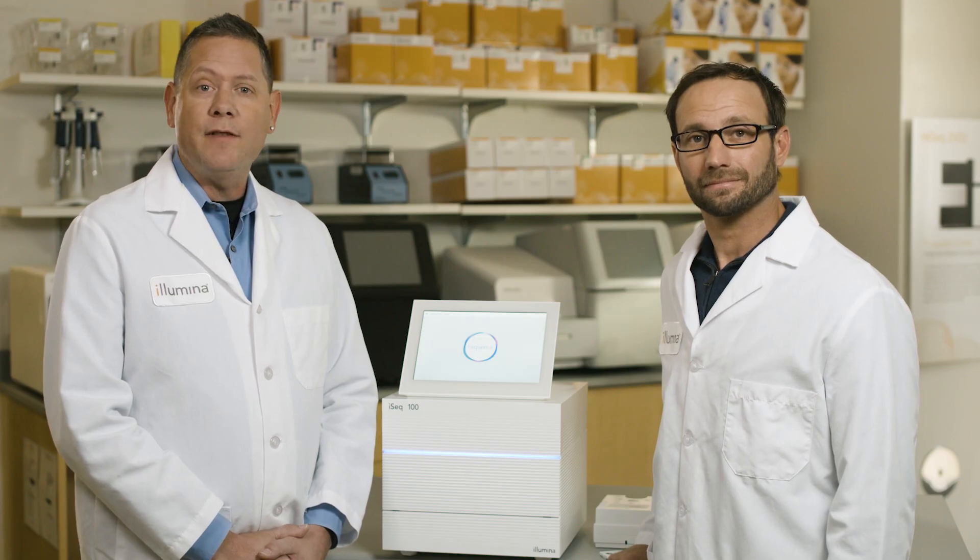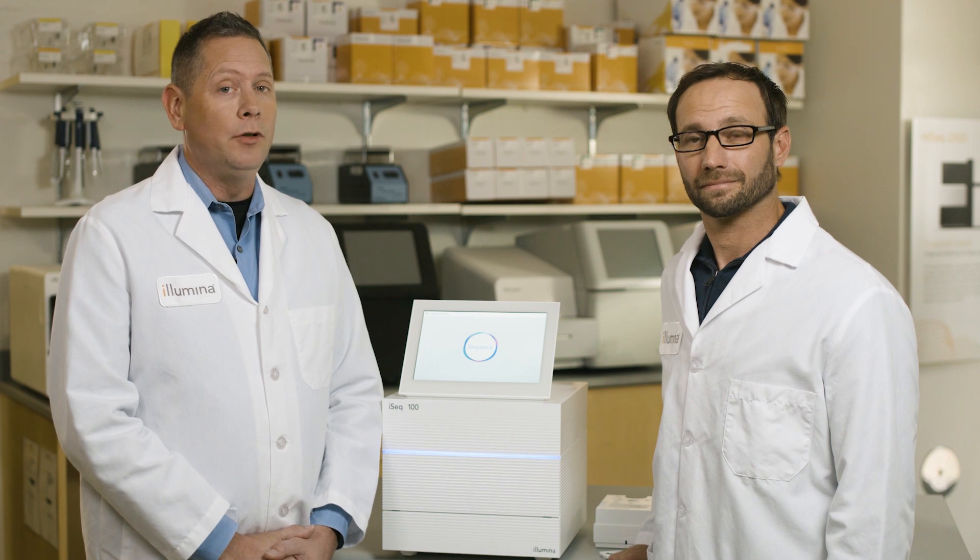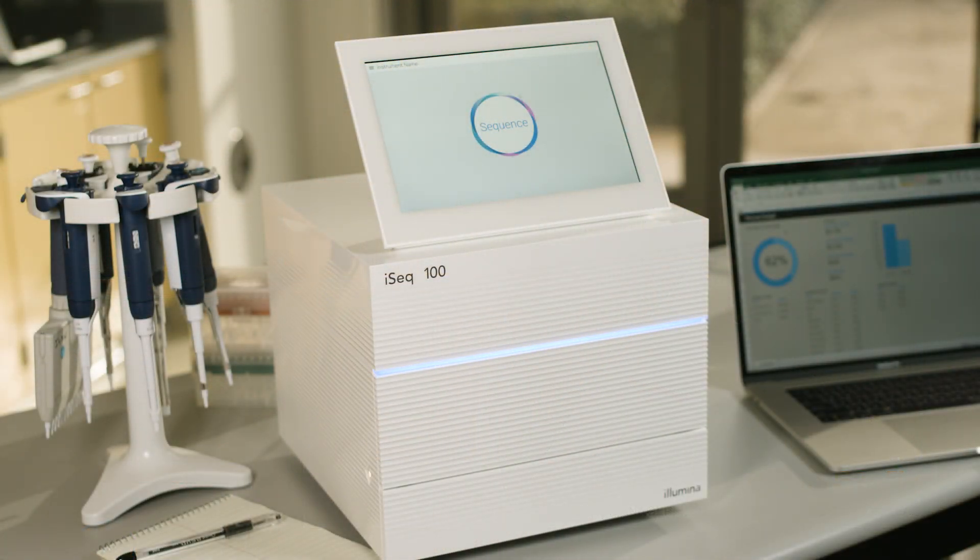This supports a wide array of applications such as viral sequencing, small panels, and small whole genomes. What I'm most excited about is the easy install and setup that allows me to quickly get up and running with the iSeq 100, as well as the fact that the platform is so small it can fit just about anywhere in my lab.